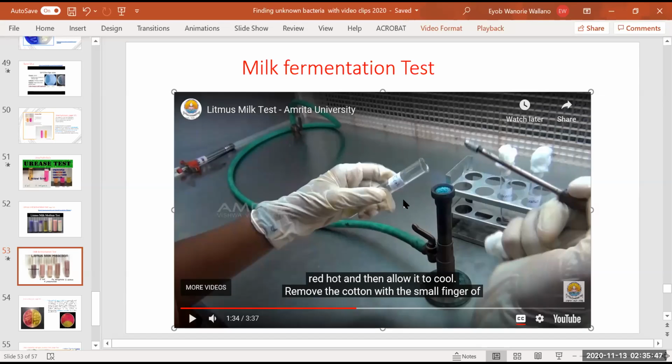When you are working in the laboratory, if you are right-handed, yes, you are going to use the loop in your right hand. But this says right hand, and no, it's not like that. If you are left-handed, you hold the loop in your left hand. So it makes it different. If you are going to use the left hand, you use the loop in the left hand. If you are right-handed, you use the loop in the right hand.